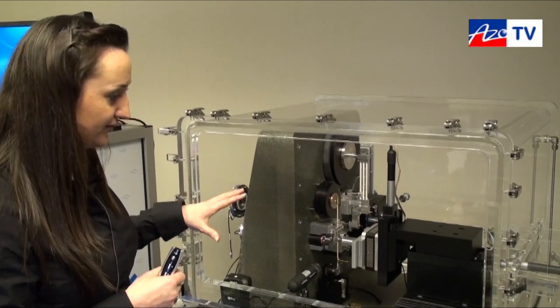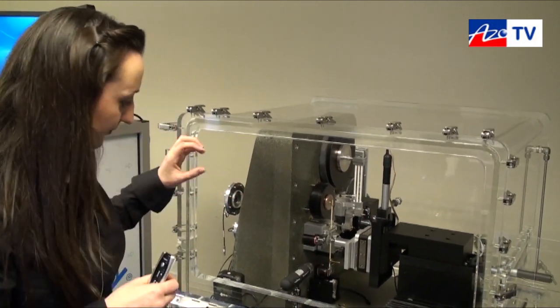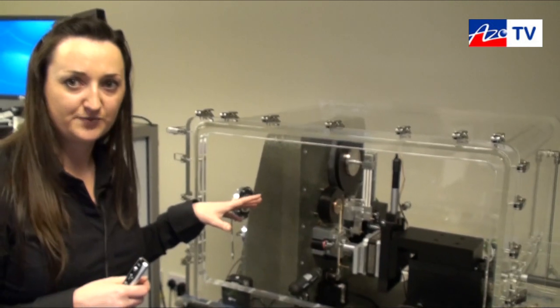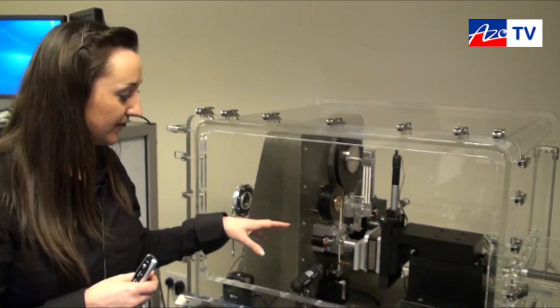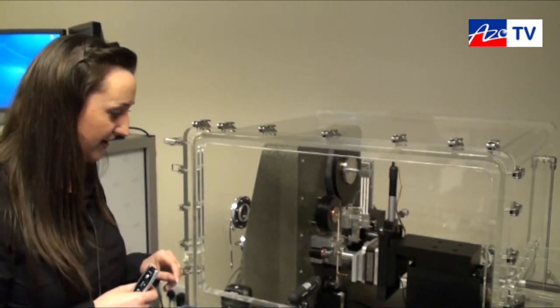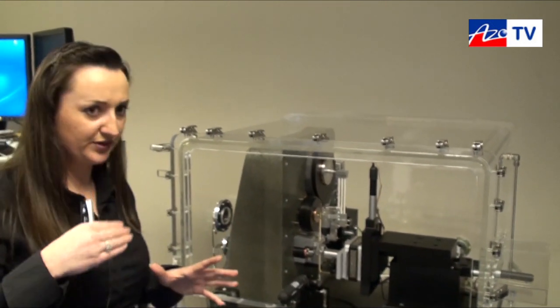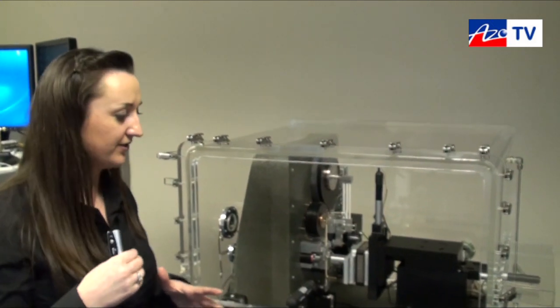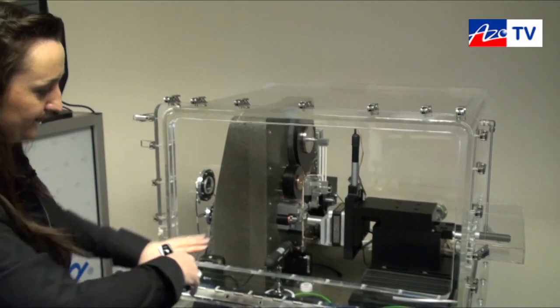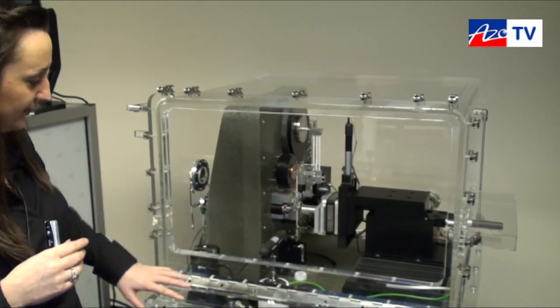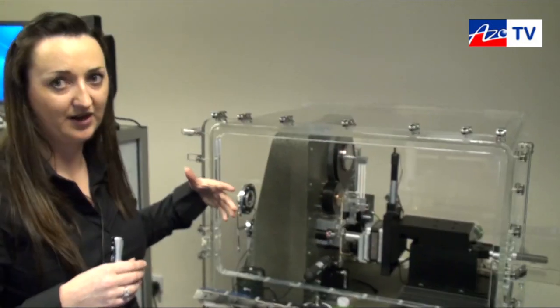Now this particular instrument is set up for purging experiments. Now this instrument can very easily be configured for high temperature measurements. So all we do is fit a high temperature shield and a hot block on the sample side. So there is another instrument next door that I can show you that's set up for high temperature. But above about, well it depends on the material you're testing, but as you go through the temperature range, particularly above 400 degrees, oxidation begins to be a problem. So we put the instrument in this perspex chamber. Now the front is missing off this just so we could see better. But we can control the oxygen in here by purging and then backfilling with argon or nitrogen.